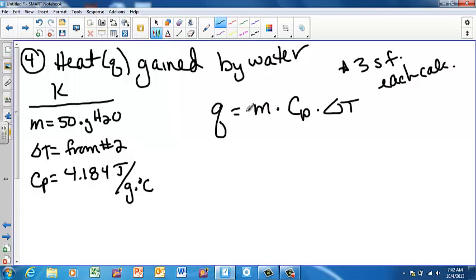Now I'm going to trump sig figs here. What I want you to do, all of it, meaning that from over here you may only have 1 or 2 sig figs, I want you to have 3 sig figs for each calculation. Okay, so leave it as 3 sig figs.